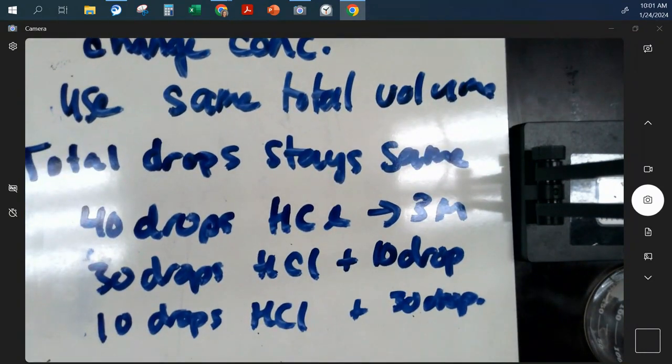So this experiment, as a group, or this is in pairs. You're going to do this in pairs. As a pair, you both need to write your procedure, but you can talk about whether you want to use this experiment to measure particle size, temperature dependence, or concentration. You need to use one of each of these 3 experiments to measure one of those. One per experiment, yes. You have to do all 3 experiments. Each one should measure temperature, concentration, or the other thing, particle size. Okay, so that's the hydrochloric acid and magnesium.